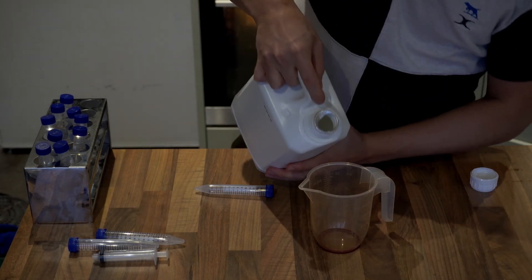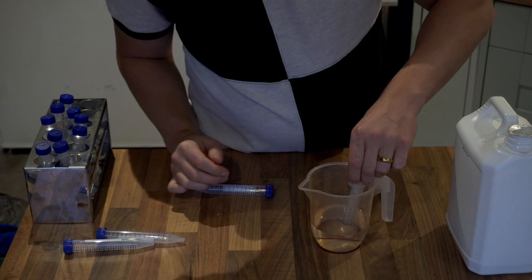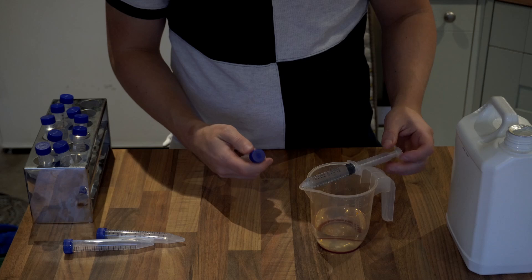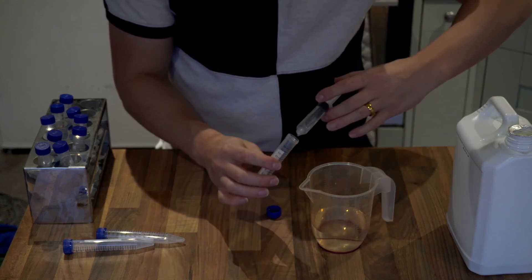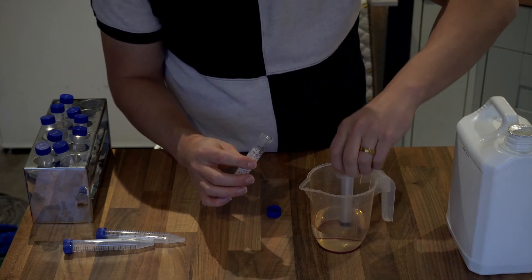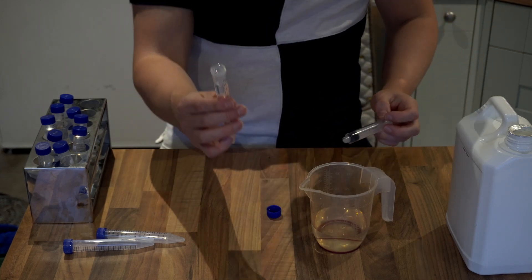I've got a 15 milliliter polypropylene test tube here and I am going to pour in 10 milliliters of distilled or deionized water. You don't want to go all the way up to the top of the test tube, but you want to get pretty close so it's easy to get the fungal culture back out when it comes to reanimation. Pour the water into the test tube, put the lid on tight, and then sterilize for 30 minutes at 15 psi.